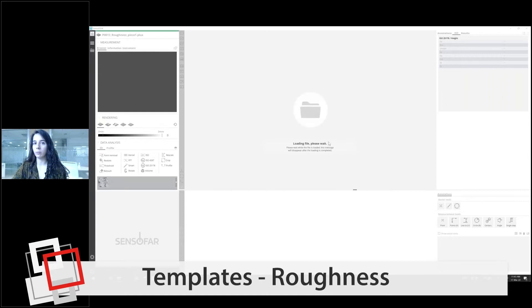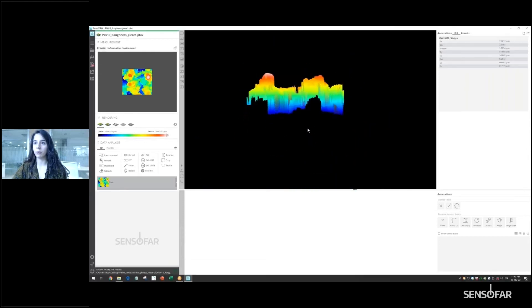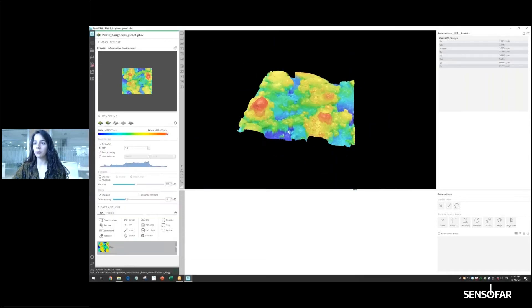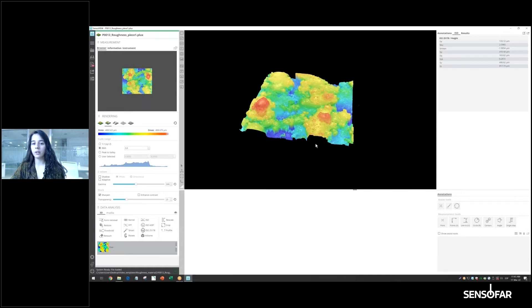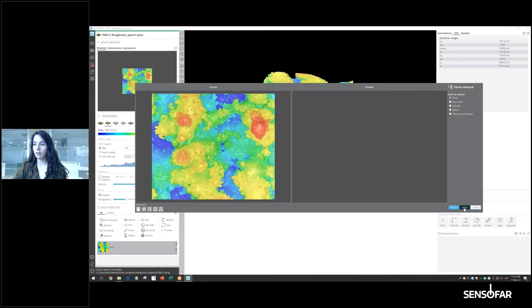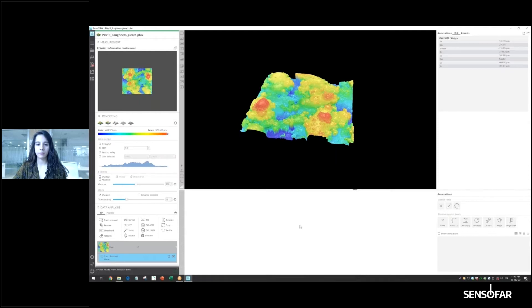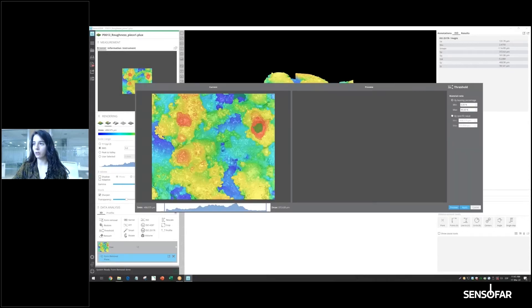We can randomly choose one — for example this one. This would be a sample from additive manufacturing and what we want to do is first apply a leveling, then apply a threshold in which we're going to eliminate 0.1 in the minimum and the same in the maximum.